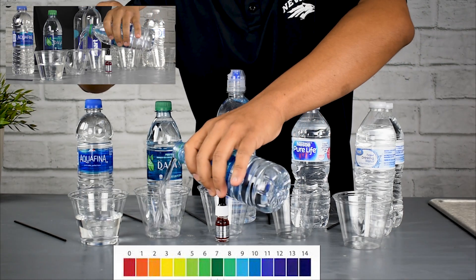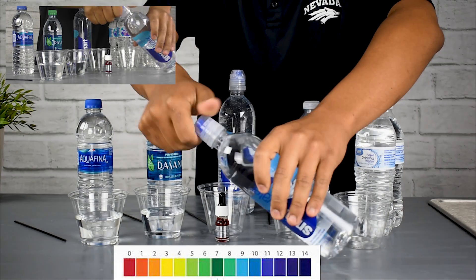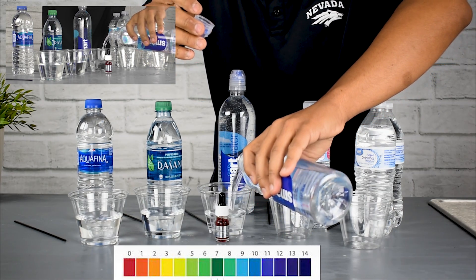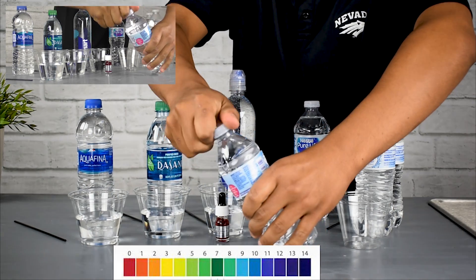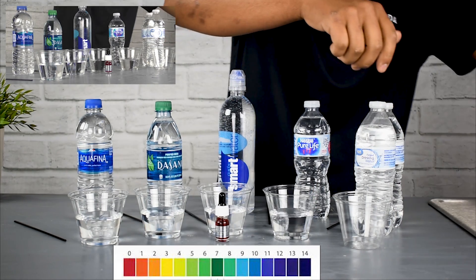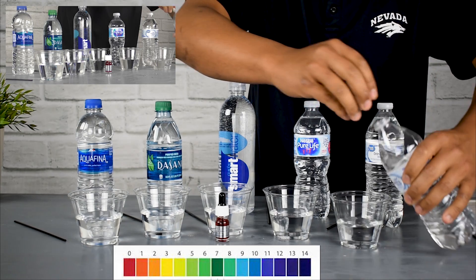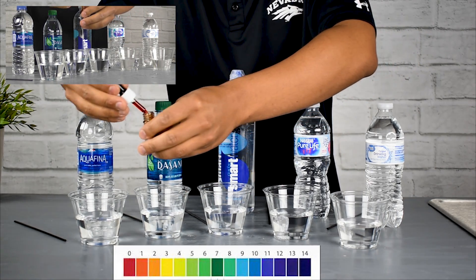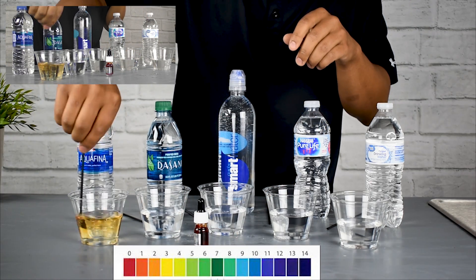We're going to fill up each of the cups with approximately the same amount of liquid. We're going to be using a red pH reagent which is going to change colors depending on the actual pH of the liquid it is placed into. We'll use individual coffee straws so that we don't cross-contaminate any of the measurements — just an extra precaution to get specific results. We're going to use three drops of the pH reagent in each cup.